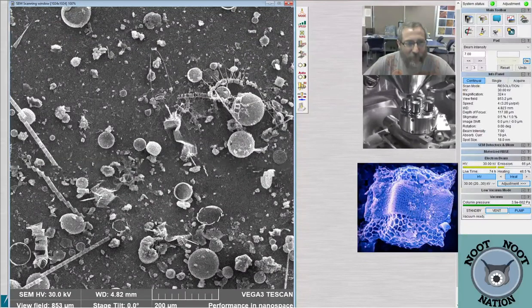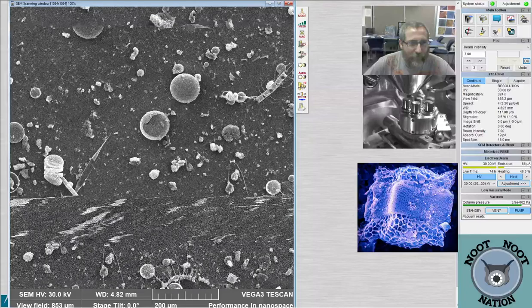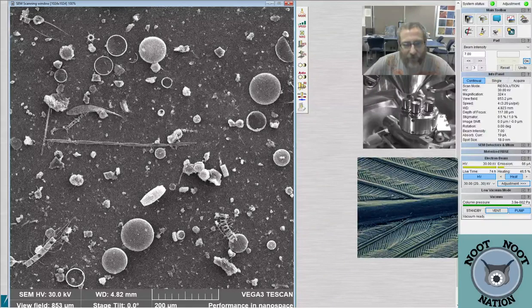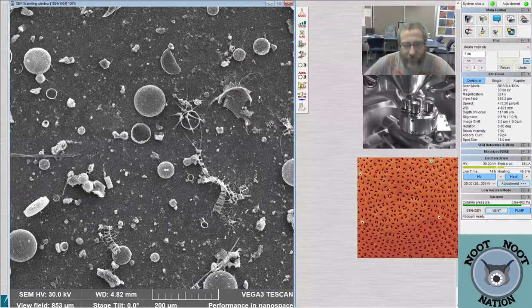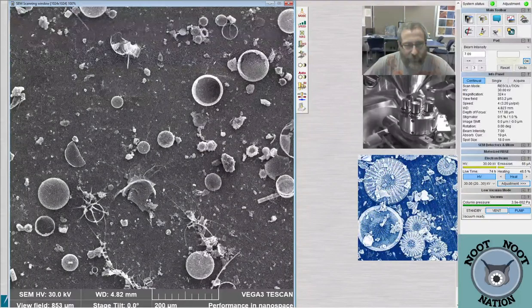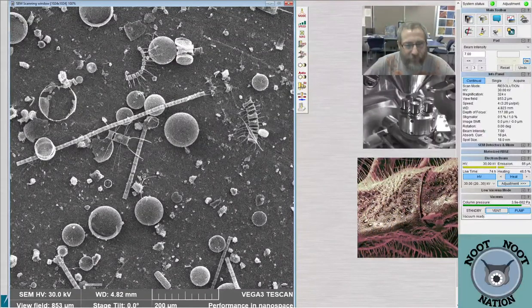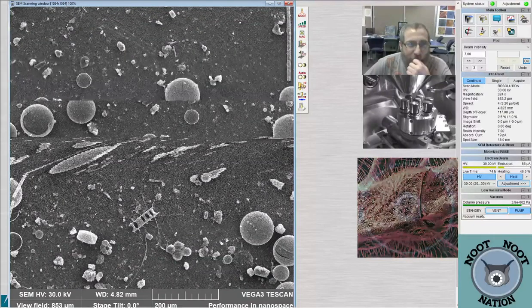Here, let's see. Where is it? It's a long chain of Pseudo-nitzschia. Yeah, on the clean ones, if we find the Pseudo-nitzschia, I'd love to get a good picture of it, because the texture on it that looks like little stripes is hard to explain to people, because you can never see it on the light microscope when it's alive. And how it moves, because the raphe's on the edge. I can get a picture. Those are easy to find. Oh. In a clean one. That'd be so cool. Yeah.